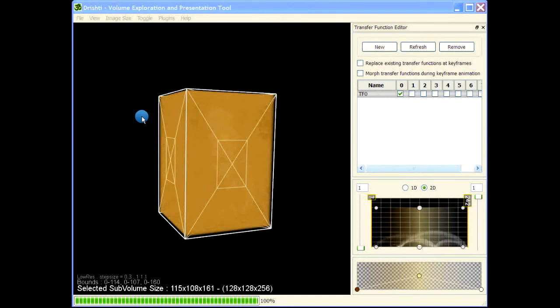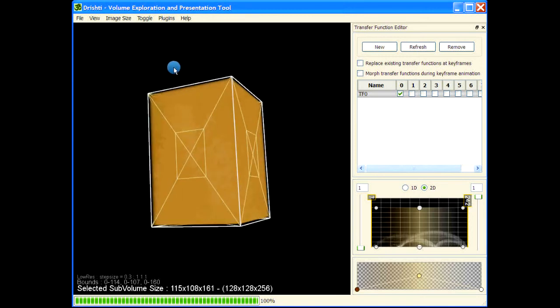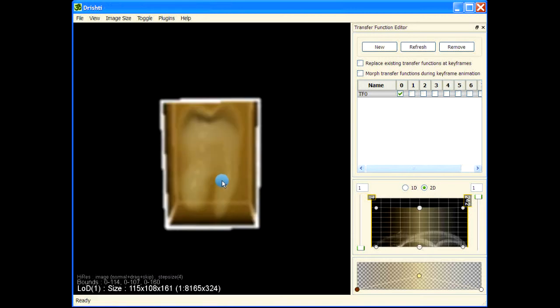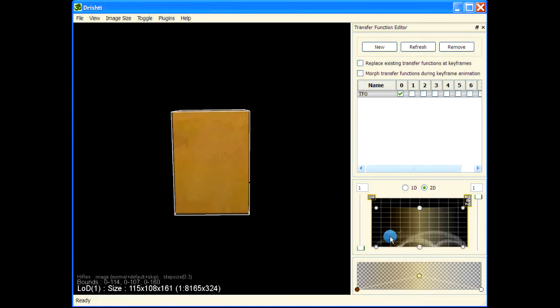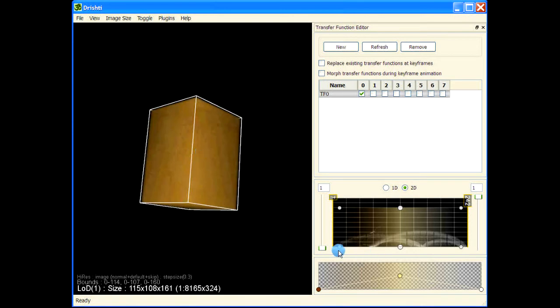This video is about working with transfer functions in Drishti. This is a tooth dataset and I'm pressing F2 to move to high-res. I'll drag the transfer function editor window to make it bigger.